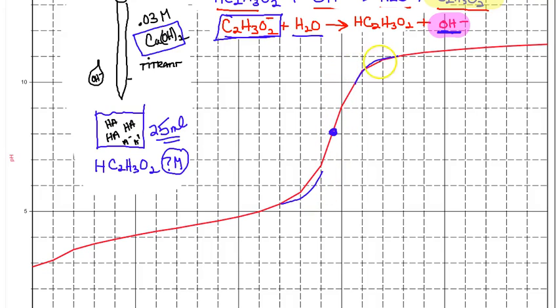All right, so I'm starting here, going here, and it looks to me like 1, 2, 3, 1, 2, 3. If you think it's right around here, it's fine, but I'm going to make things easy for myself. It looks to me like it should be higher, so let's just deal with it there. Again, I'm estimating based on how these things are panning out, and it looks to me like the middle of the asymptote is a little above. So I'm going to do it right here. This is my equivalence point.